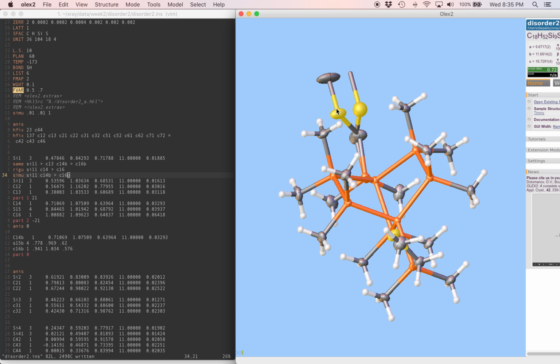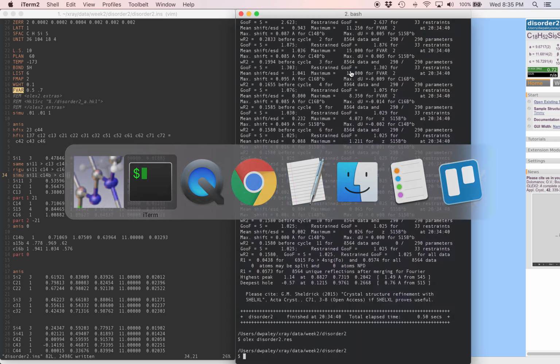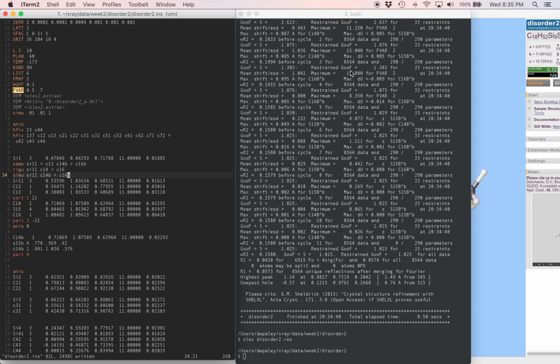We can start by adding our hydrogen atoms back in. If there's one hydrogen on this carbon that happens to be sticking over in this direction, it's actually going to have pretty comparable scattering power to the carbon that we have there. So we better put that hydrogen on there and just make sure that that scattering is accounted for.